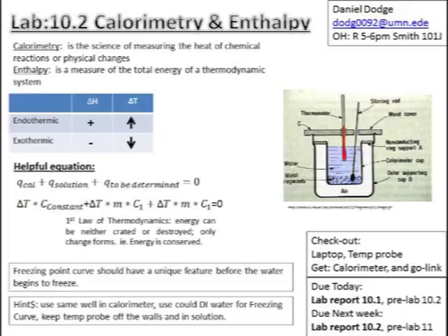And the final one is what we're trying to measure. You might see it called Q solution, Q dissolution, or Q of what you're measuring. This is also comprised of a delta T term. That's pretty simple. We need to know how much temperature change. It's comprised of an m term, how much mass of what you're trying to measure, how much is being dissolved, how much is being burned, and so forth.